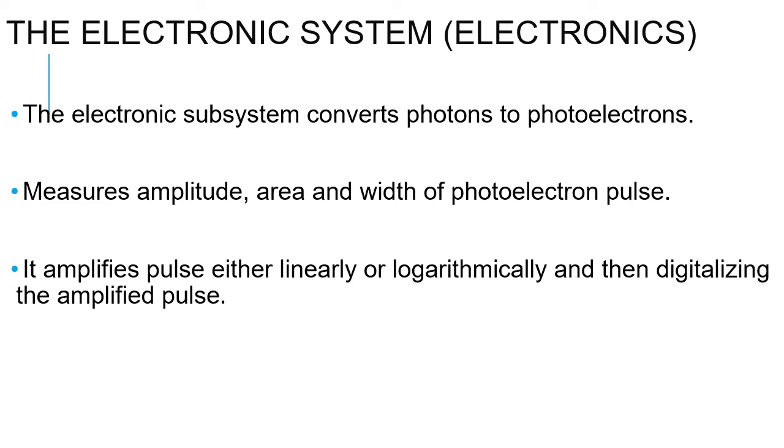In the next part, we will discuss how data analysis is done by using this flow cytometry technique.